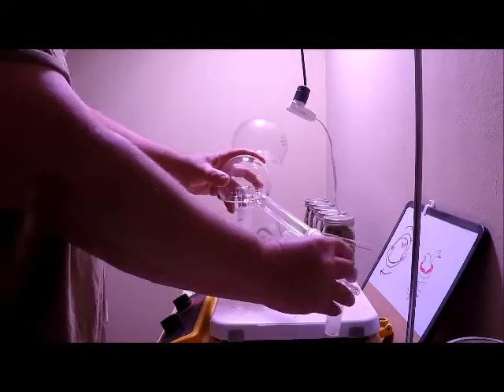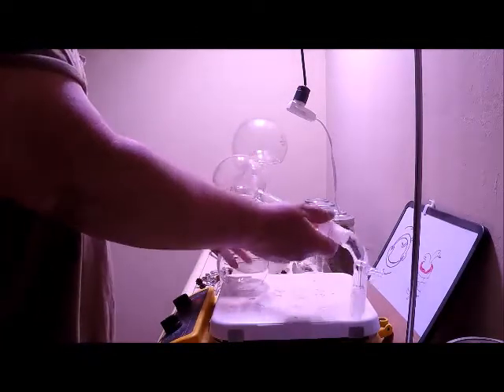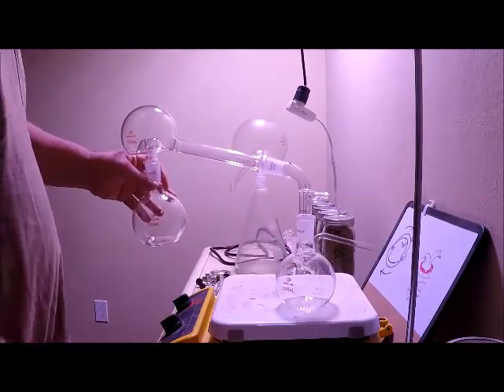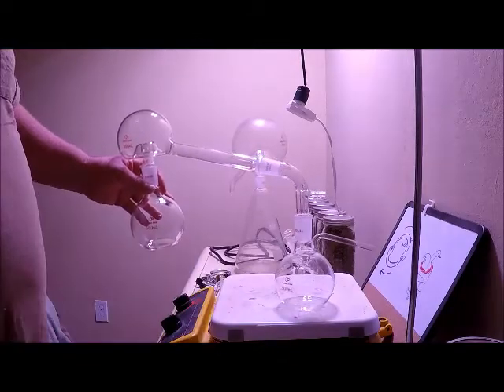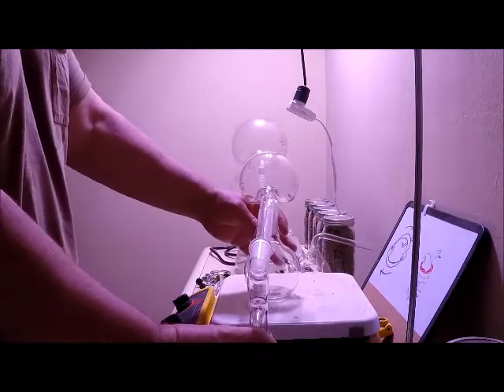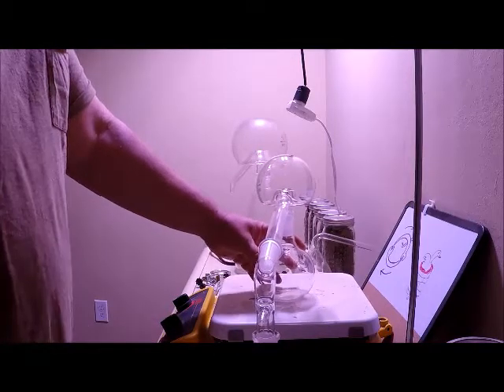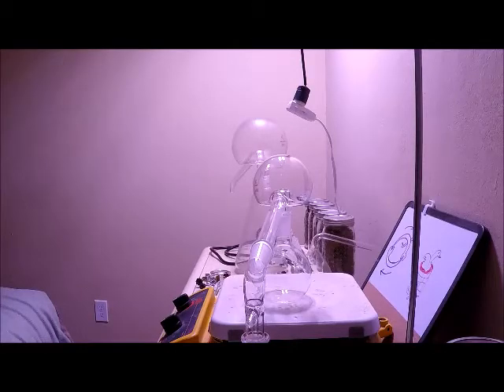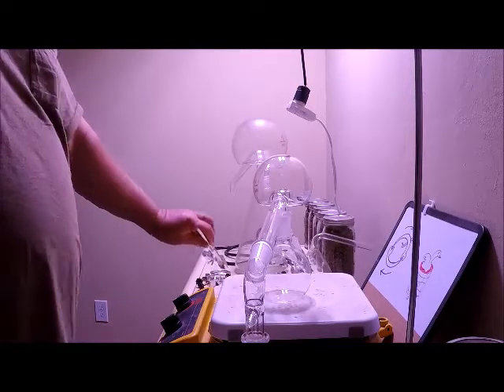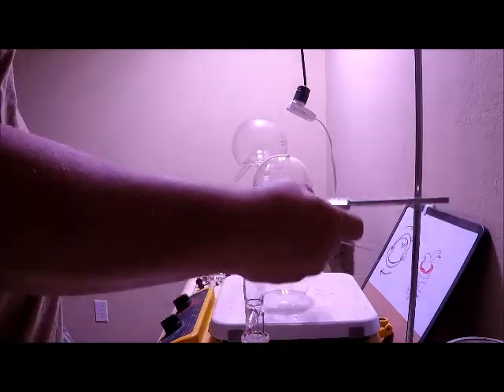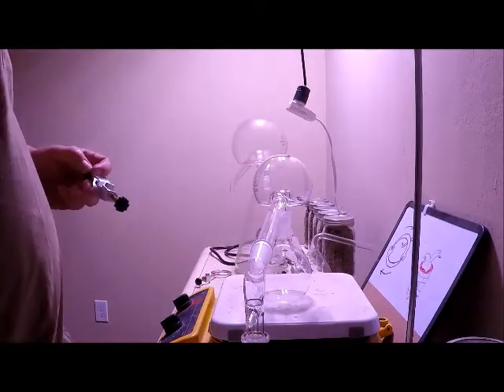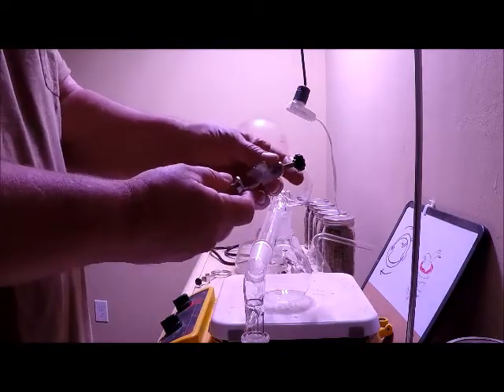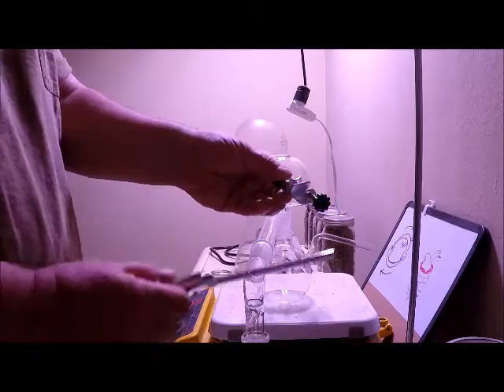So I can put this on the end here if I need it and add this. And then if I need to, I can use the clamp stand. The clamp stand came with this weird adapter and it's for this thing, mounting it to the pole.